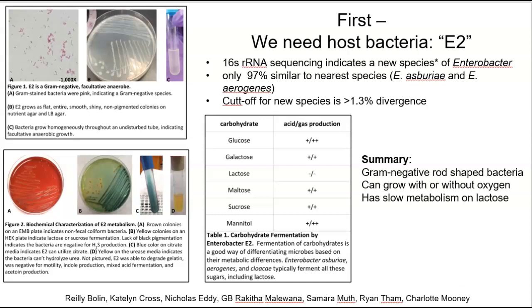One of the new bacteria that we found, we characterized more, and this one we named, well, it's temporarily called E2. And this is just because this was the second isolate that we got from Eddington. That's what E2 is.